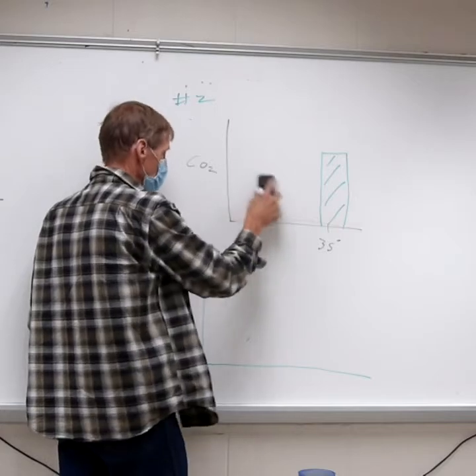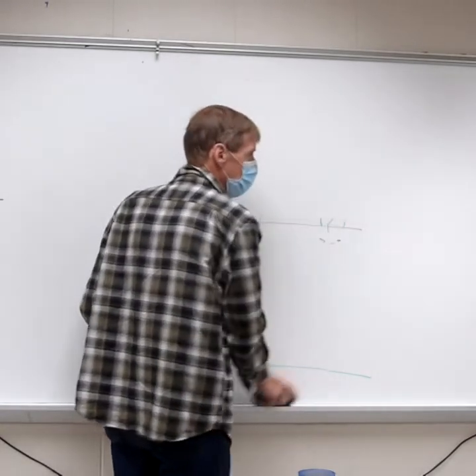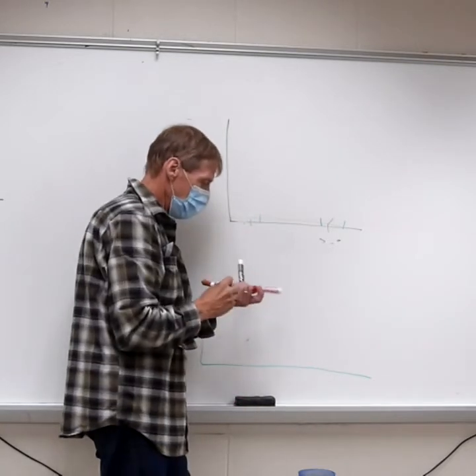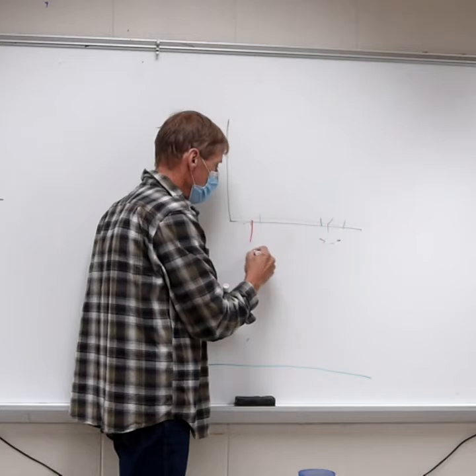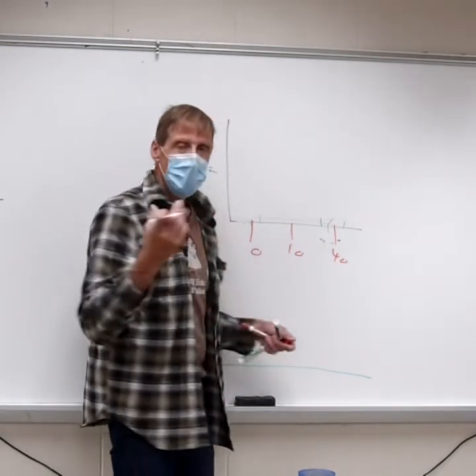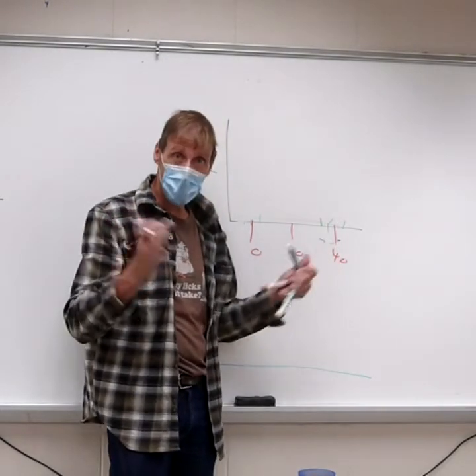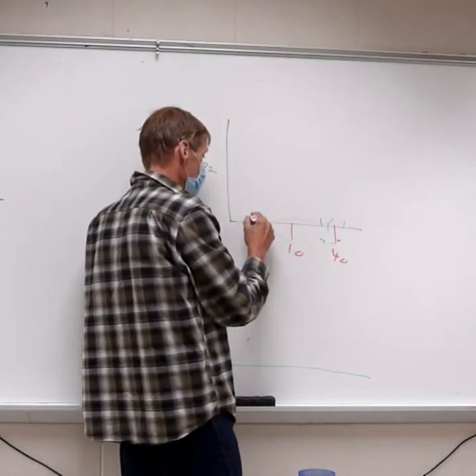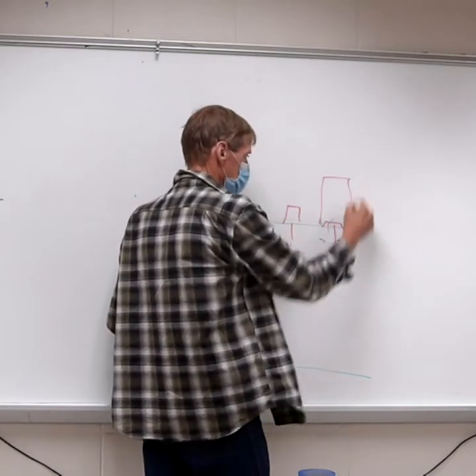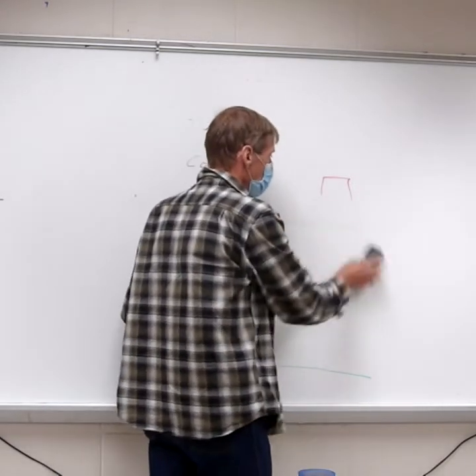You could use the amount of sucrose you added. In that case, we have 3 different amounts of sucrose: 0, 10 grams, or 40 grams. You have 2 at 0 grams, 2 at 10 grams, 2 at 40 grams. Average those 2 together, and see what your charts look like. I don't know what they'll look like. Who knows? That is all you have to do.